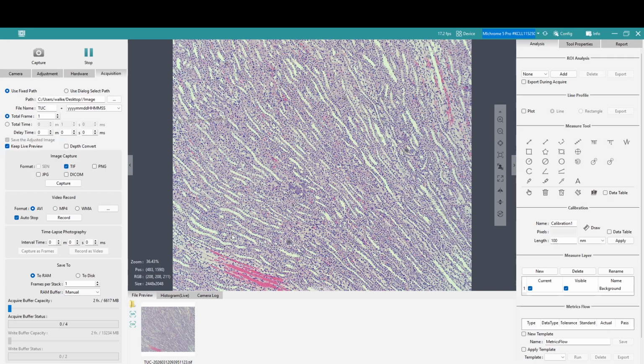Other than that, that's just your basic info on the software and everything like that, and kind of help get you started. They have a lot of very helpful video tutorials on their website should you need to go in depth on anything else.